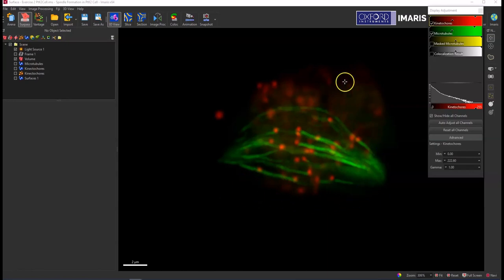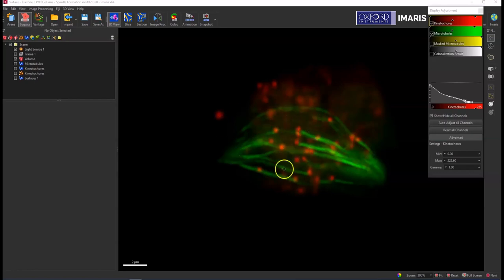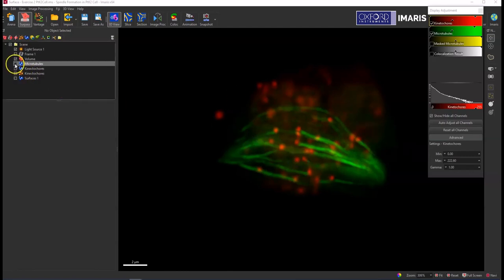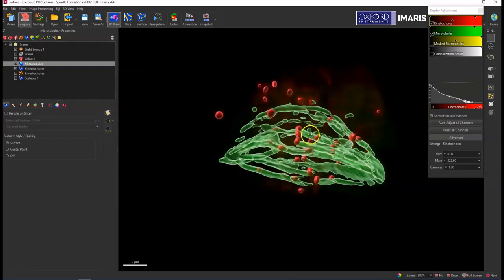So what I'm looking at right now is in green some microtubules and in red a kinetochore stain, and I'm going to try and determine how much of the kinetochores is co-localized to the microtubules. So I've already created some microtubule surfaces that is a fair enough representation of the microtubule signal and then a kinetochore surface.